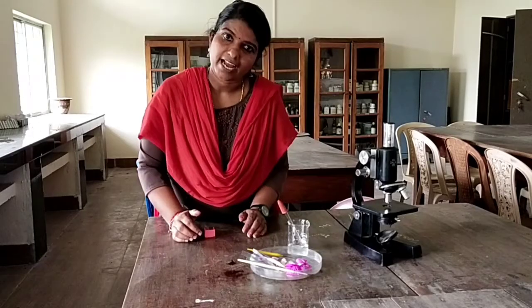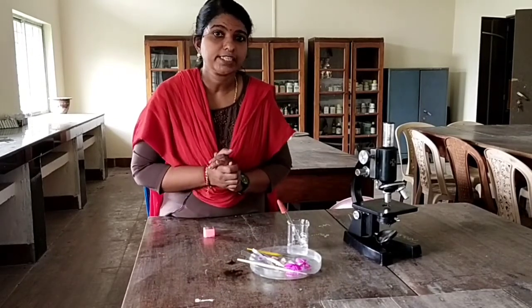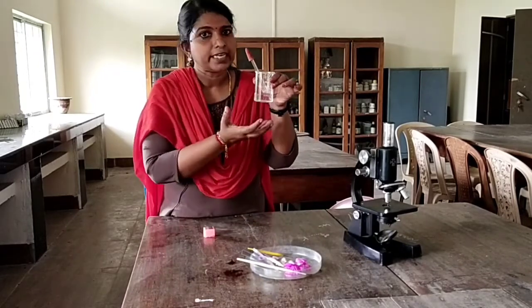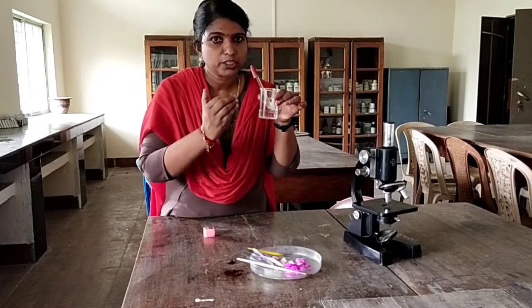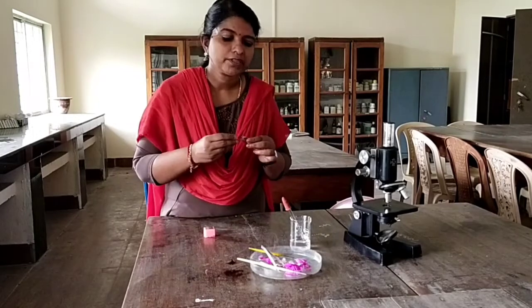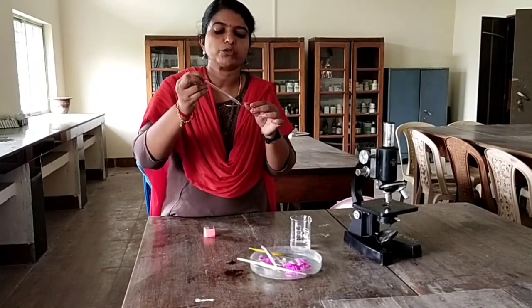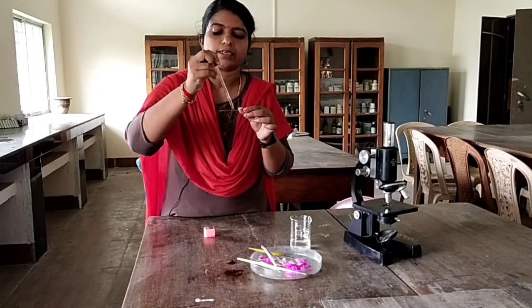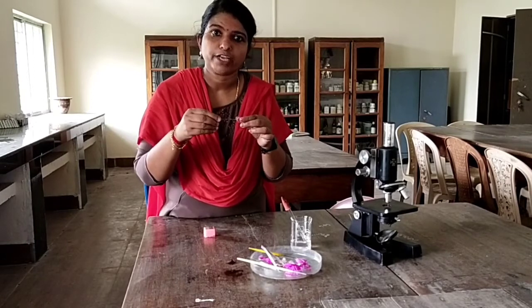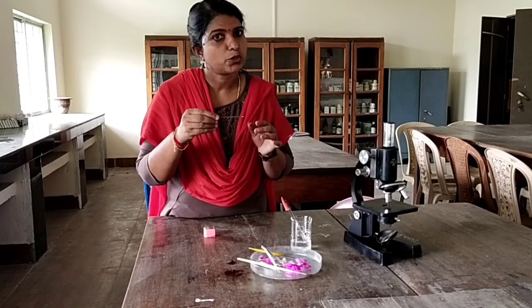Now let us perform the activity. This is the nutrient solution and you know the ingredients. Take a clean glass slide and add one or two drops of this nutrient solution. After that, dust the pollen grains of a freshly plucked flower into this nutrient solution.